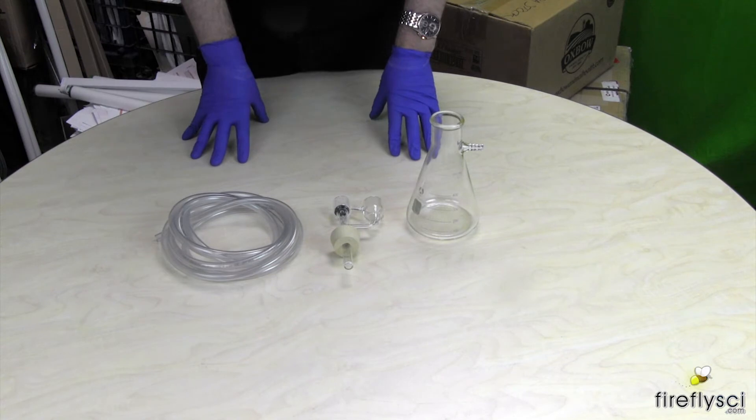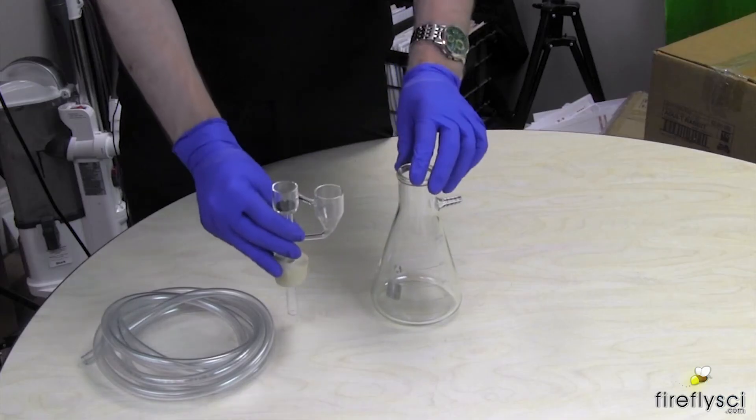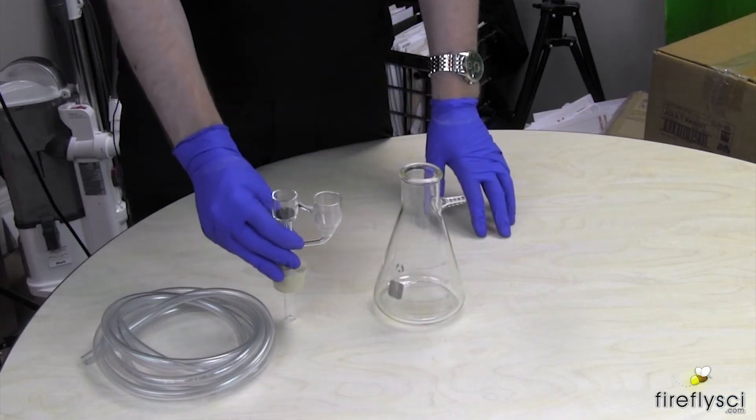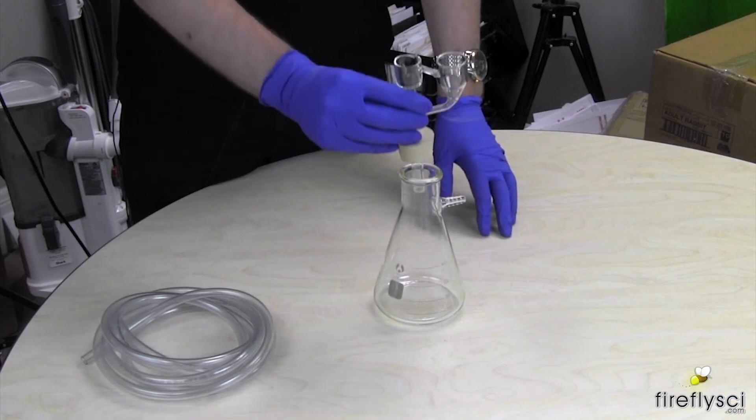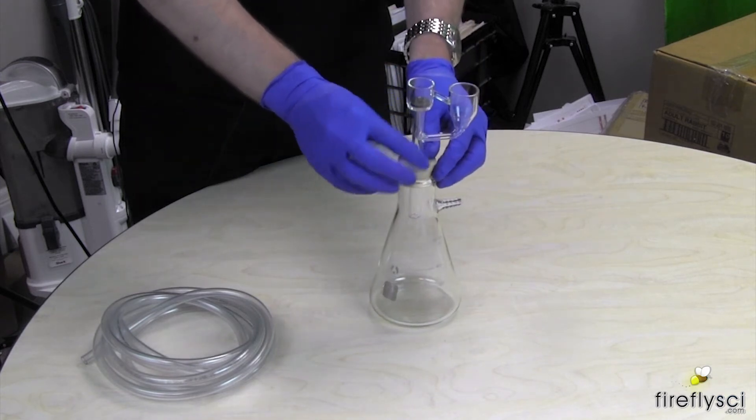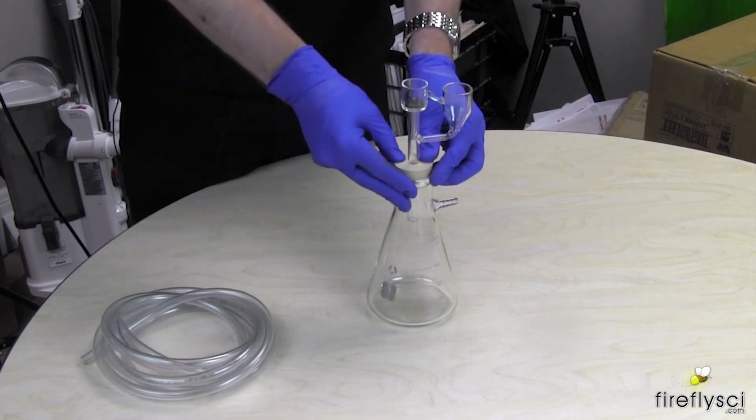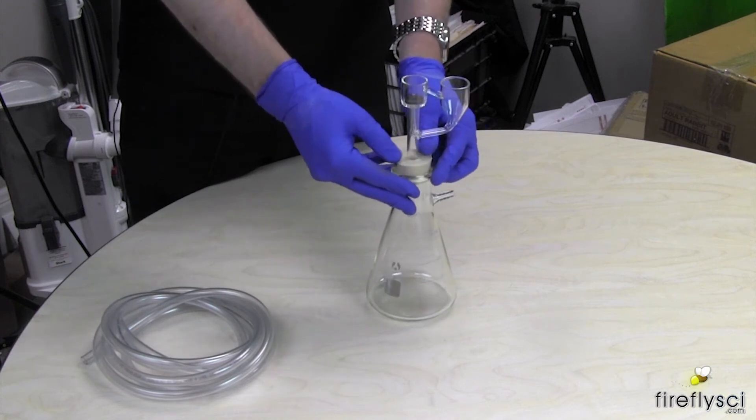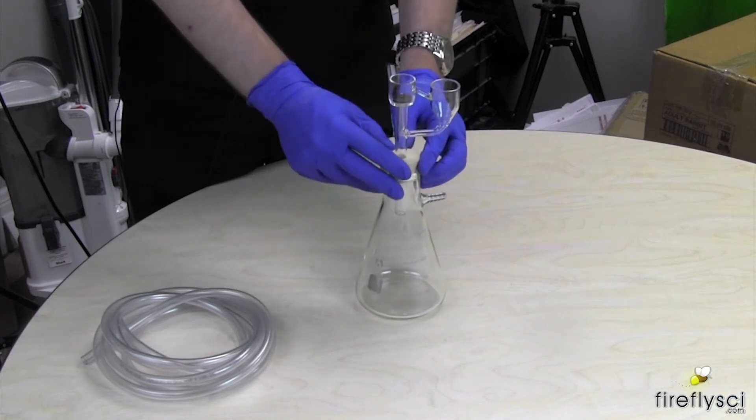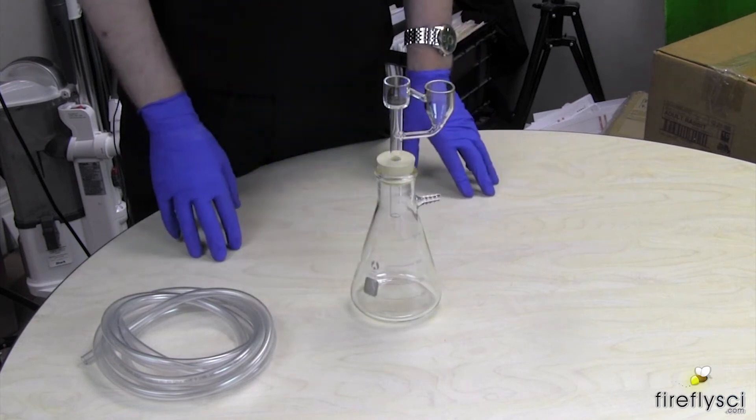So let's go ahead and get this hooked up. So in the first step of setting up the cuvette washer, we're going to take our cuvette washer here and put it right down into the vacuum flask. Make sure you push down so there's a good seal and we're ready for step number two.